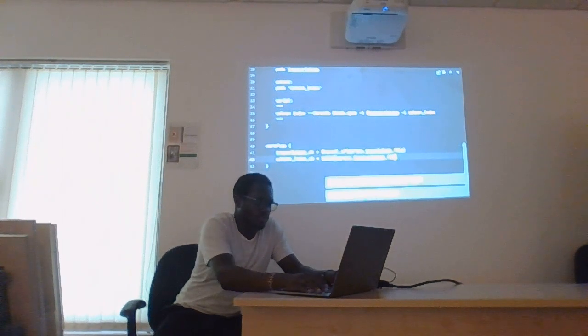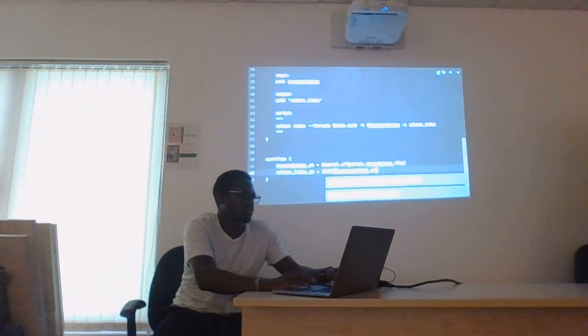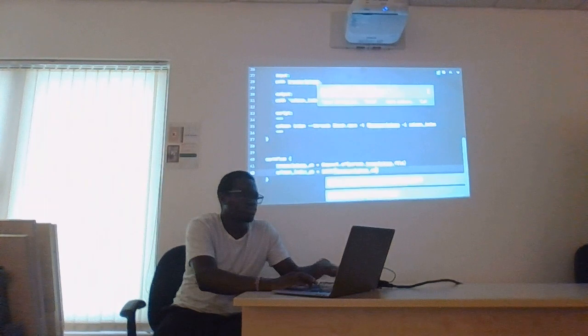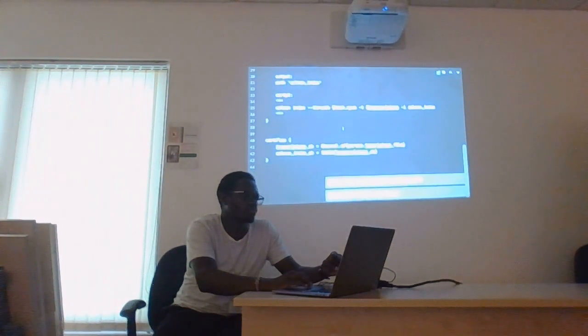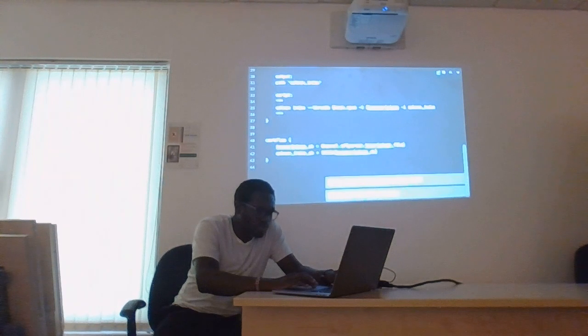And then instead of using the params there, now as a channel, transcriptome file, transcriptome channel.